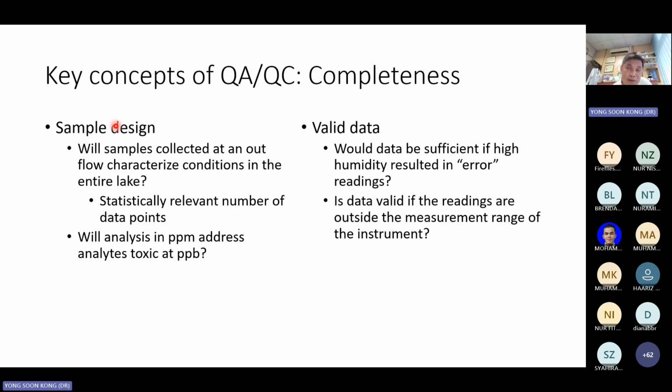Yeah, why you don't? Amount yang kita guna untuk parameter tu tak sampai untuk seberapa banyak botol yang kita nak ambil itulah. Okay, kalau cukup 60 botol, you ambil 60 botol, balik semua valid, tapi nak analyze 60 ke? Kalau untuk duplicate boleh lah doktor. Okey, kalau larat kan? Betul tak? Betul juga doktor. Okey, kalau larat dan kalau perlu.